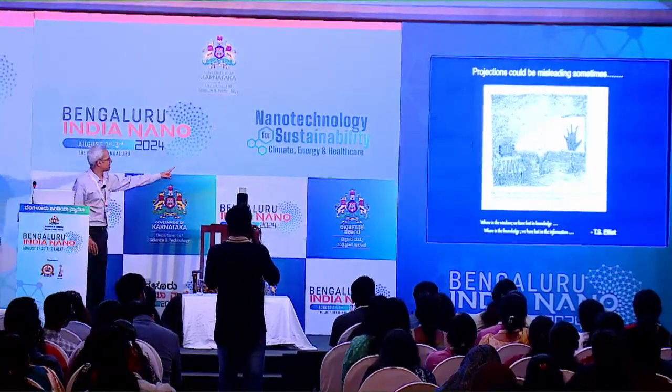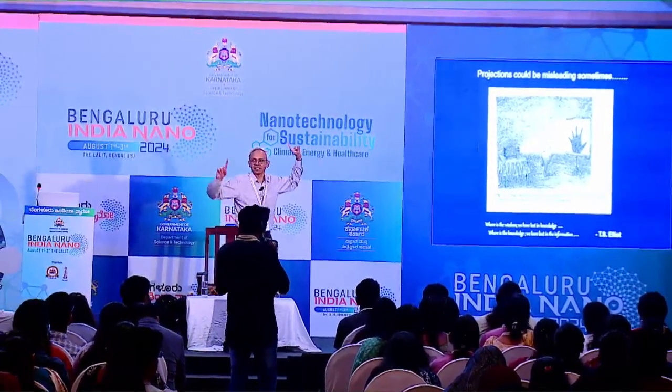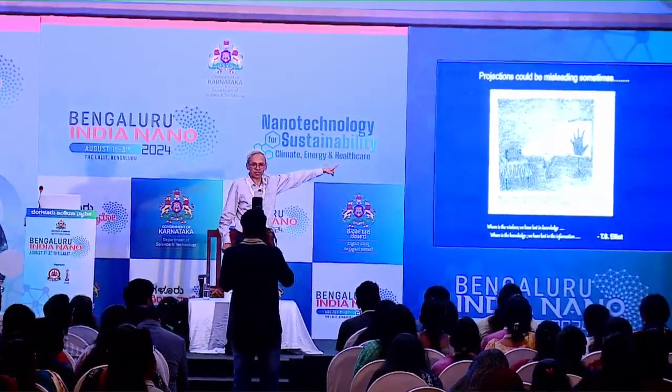But again, the point, as you can see, is that these are projection images. This is a tortoise or a rabbit that's standing on its head, and it looks like a hand in projection.